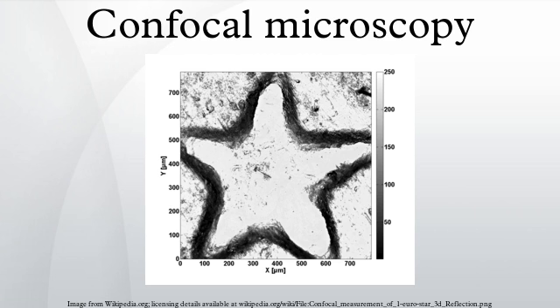Programmable array microscopes use an electronically controlled spatial light modulator that produces a set of moving pinholes. The SLM is a device containing an array of pixels with some property of the individual pixels that can be adjusted electronically. The SLM contains micro-electromechanical mirrors or liquid crystal components. The image is usually acquired by a charge-coupled device camera. Each of these classes of confocal microscope has particular advantages and disadvantages. Most systems are either optimized for recording speed or high spatial resolution.